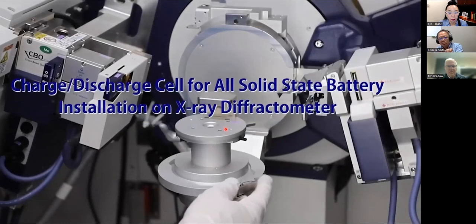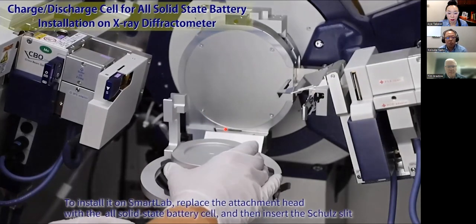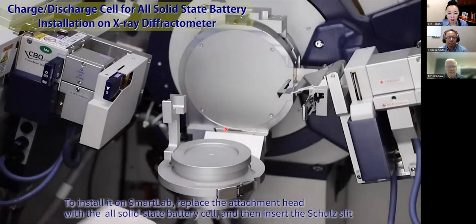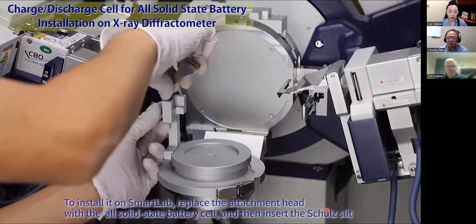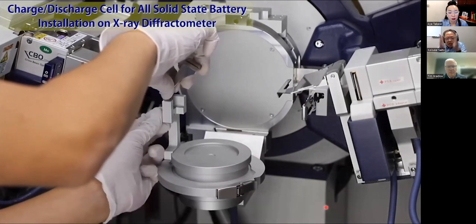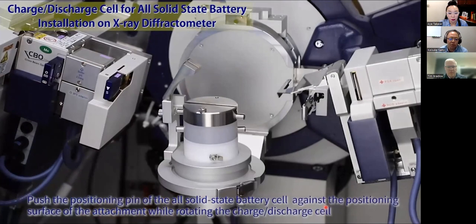Then we removed the protection of the X-ray window already. It is not videotaped, but we removed it. And this is the diffractometer. We have a dedicated mount or support for the solid state battery cell. Because the X-ray window is very thin and tiny, we decided to have this kind of slit. This slit is controlling the beam size towards the X-ray window so that we don't get any diffraction signals from the outside of the X-ray window.